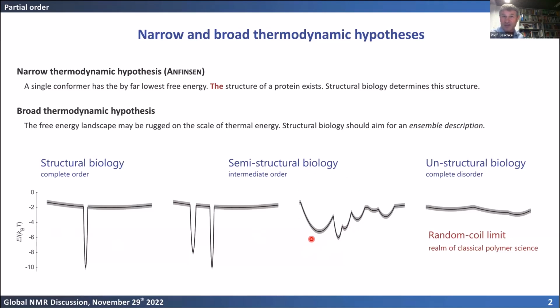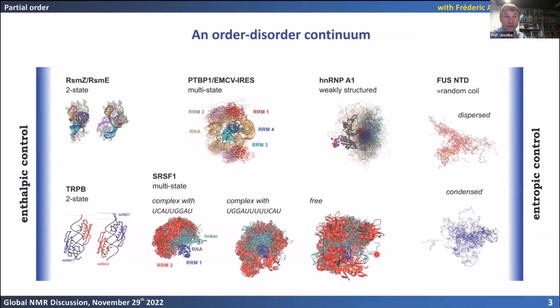And then the question is, why was this hidden for such a long time? And the answer basically is, if you have only a single structure determination method, you will not be able to get the realistic ensemble of such a protein. Now, here's a small, very small zoo of such structures obtained based on EPR, distance distribution restraints, and other data.